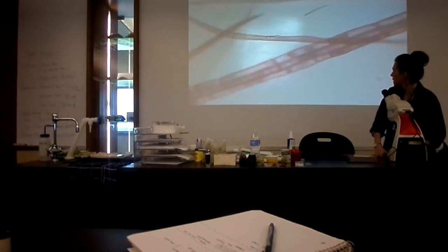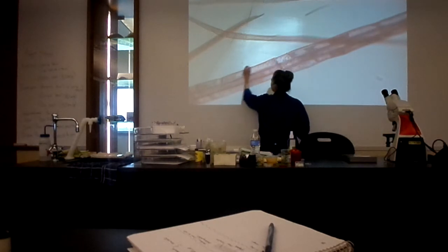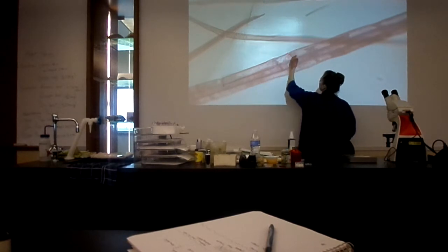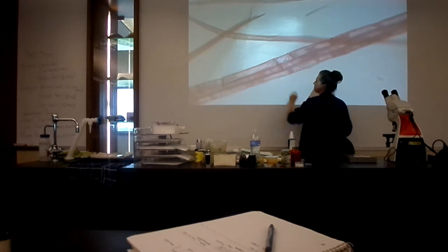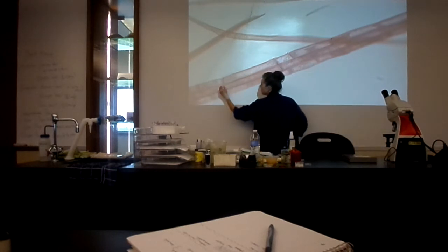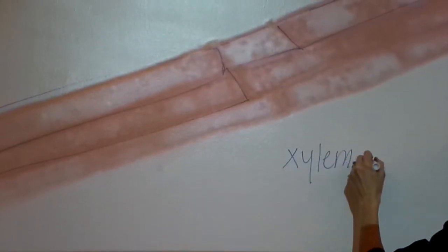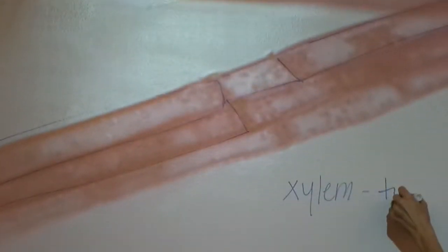Okay? What I want you to notice is that I've got lots of cells that are kind of stacked on each other. Now, the tissue that we're looking at here is xylem. This whole thing that we're looking at is xylem tissue. It transports water.